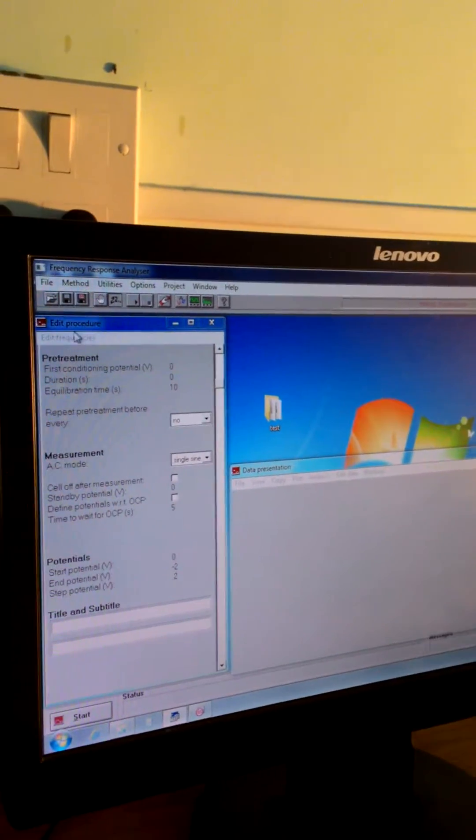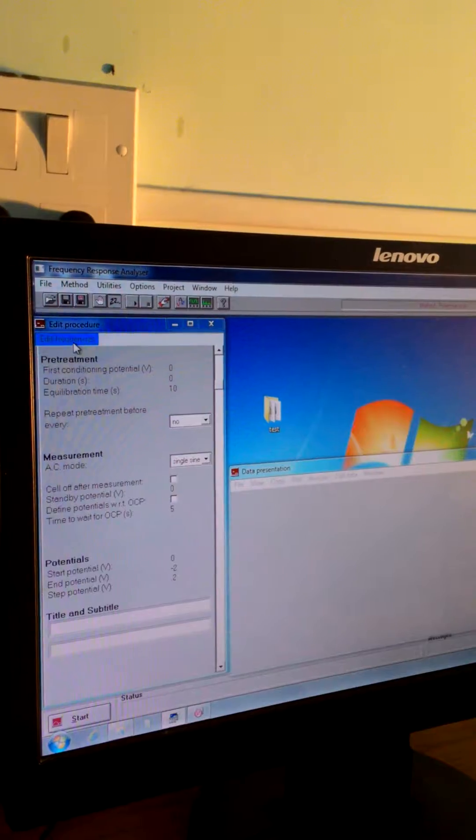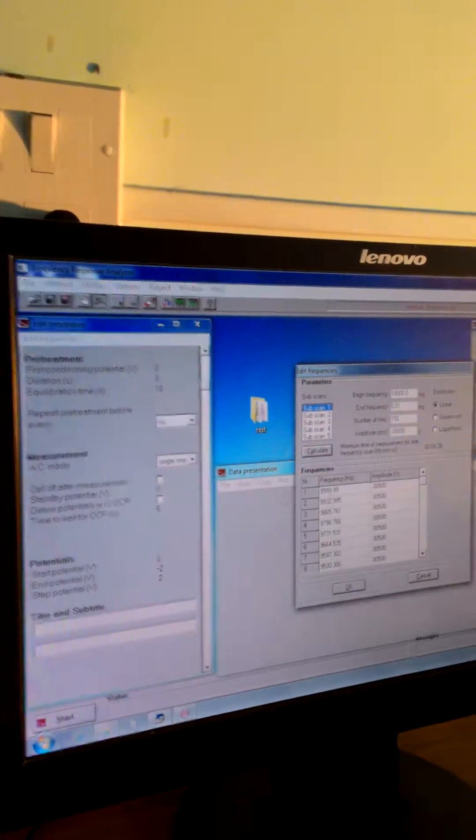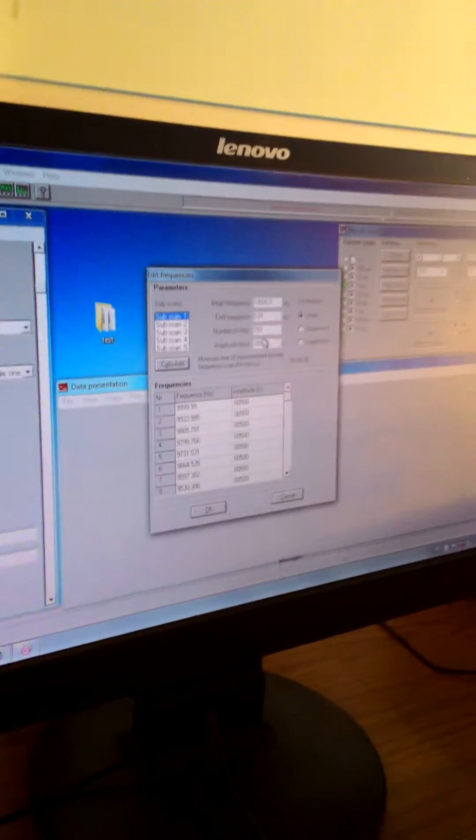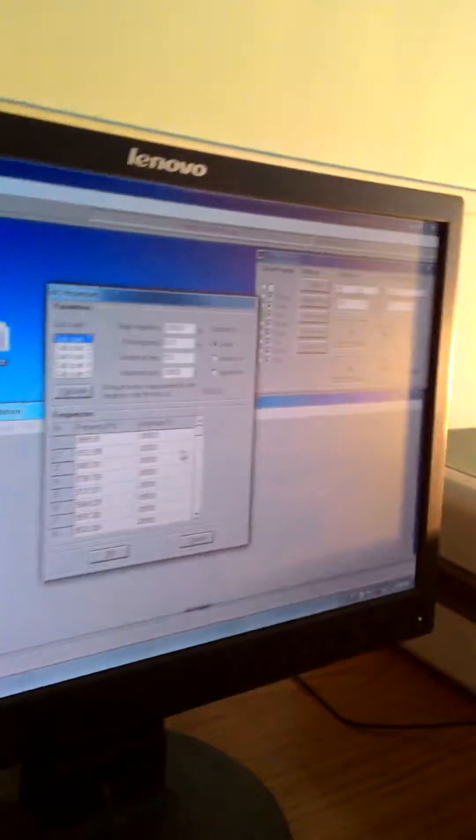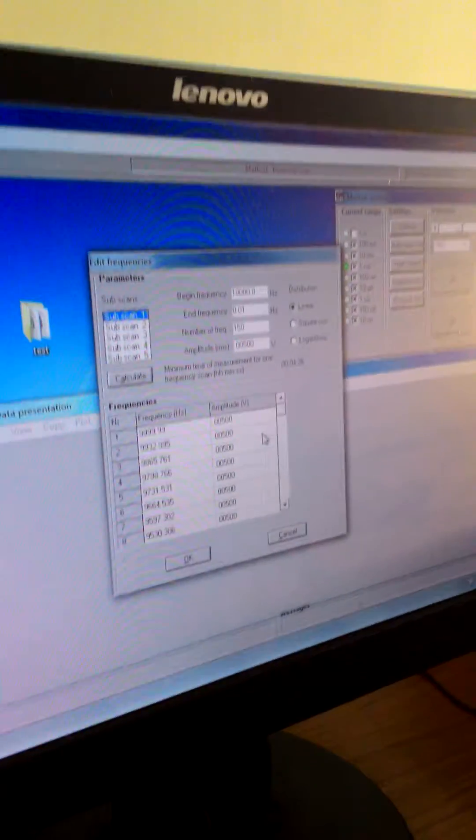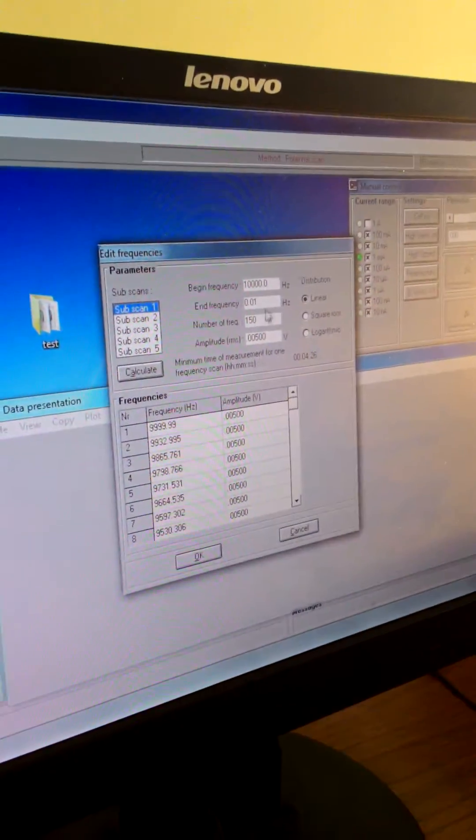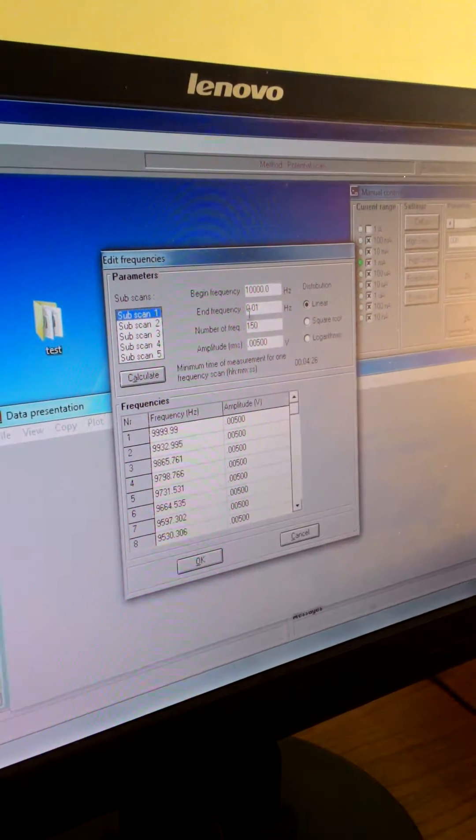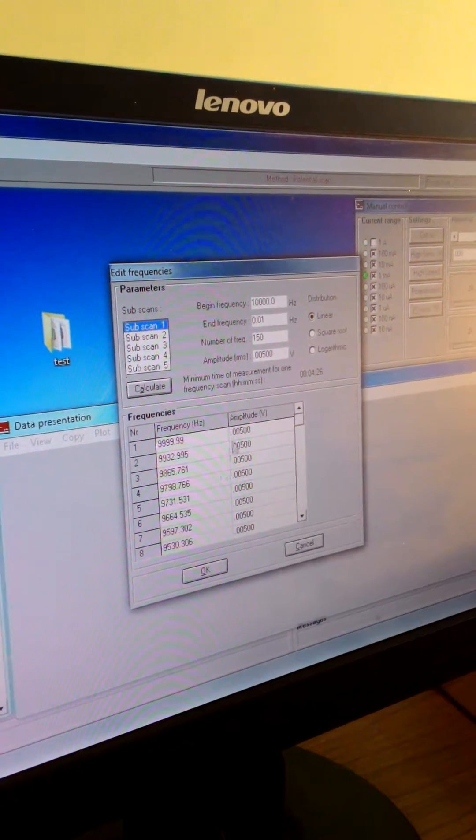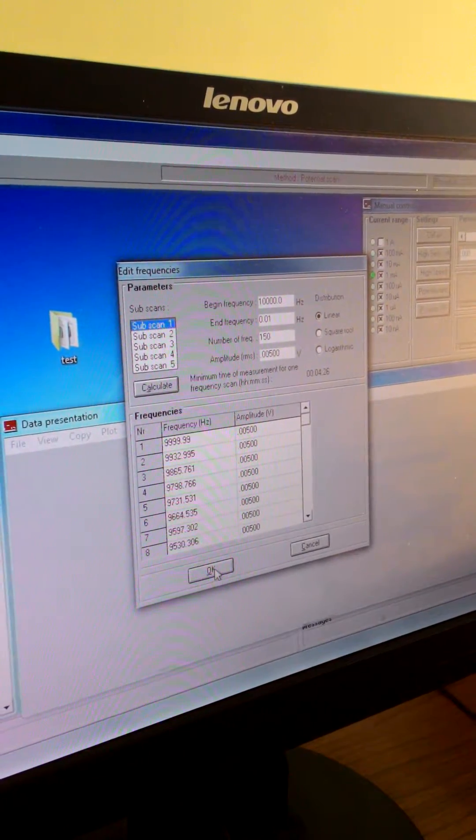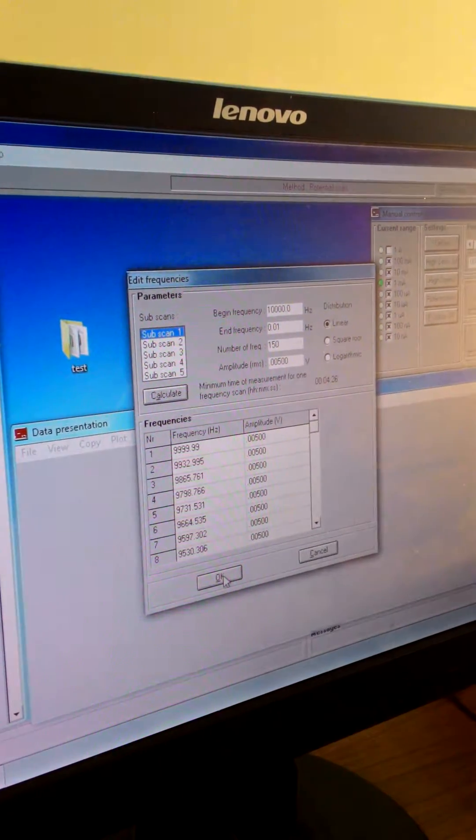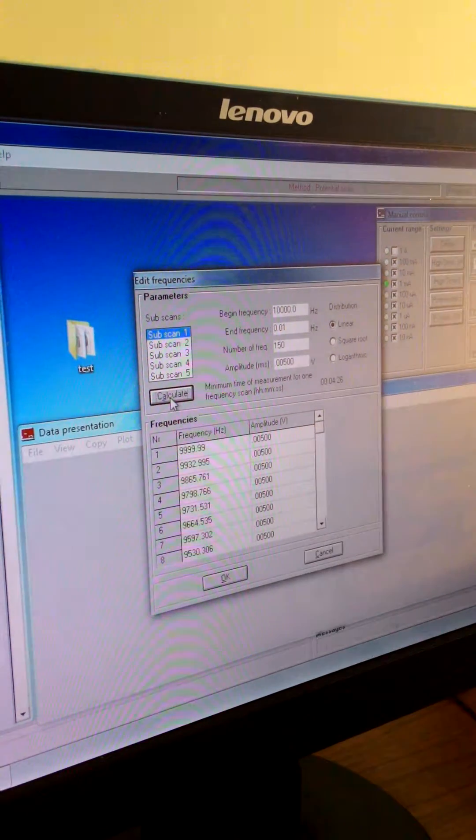Now edit frequency, whatever you want to put, like linear. It is okay. From this frequency to this frequency, this will do it. Just calculate.